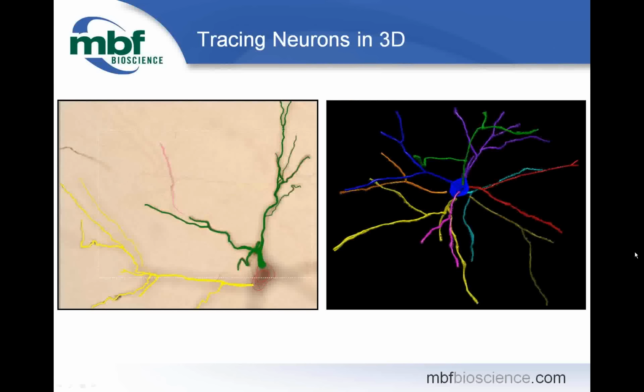To create a realistic, meaningful, and quantifiable model of a selected neuron from a biological specimen, Neurolucida provides tools to allow you to place points that represent the location in 3 dimensions of each portion of the segment, spine, or soma, approximate the thickness of the axons and dendrites at each point, and specify and classify the spines on the basis of shape or head diameter. Editing tools allow the user to erase or add branch points, entire trees, and group selected objects for analysis.